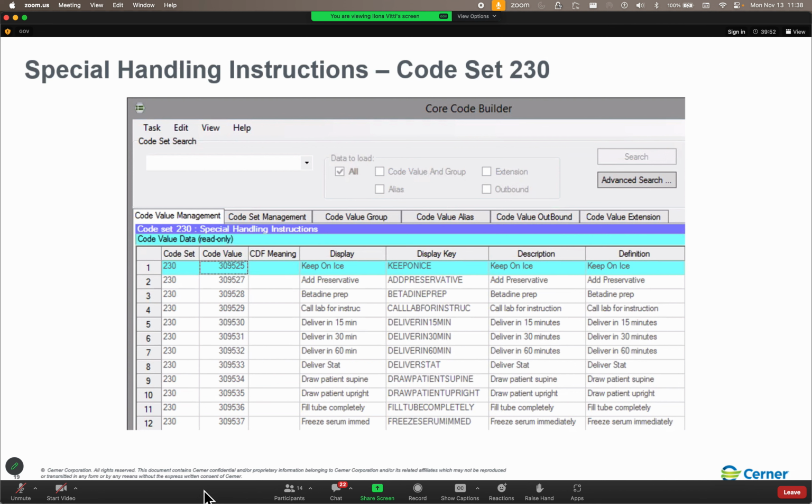So what would need to happen is that someone in the lab goes, wow, it's a really high accession number, and then we should probably let IT know that they need to increase that sequence length. Now, what does happen is that you're going to get calls: hey, we can't pull up accession number 10,001 from today, because there's only 4 characters at the end. So that's what usually happens.